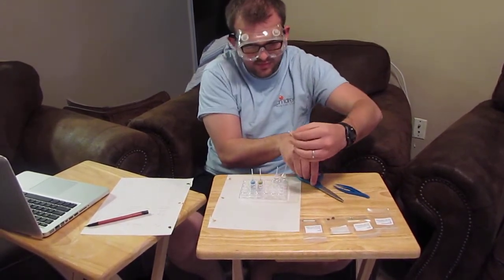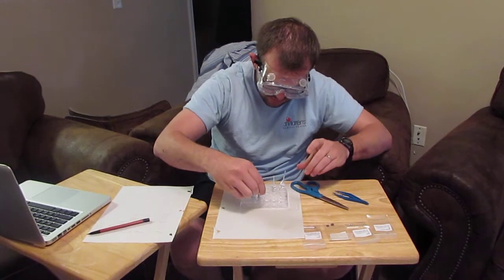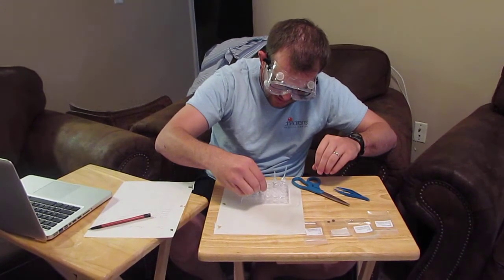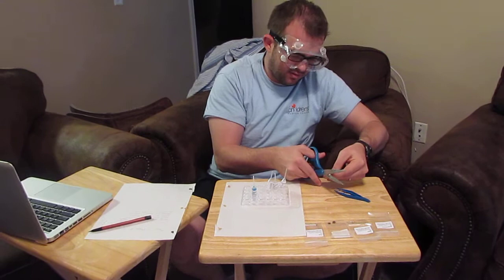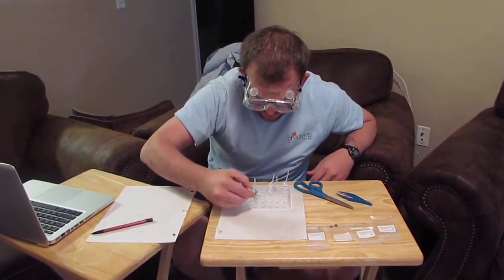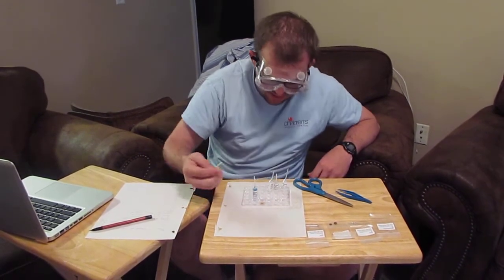I have zinc nitrate. In A3, 2, 3, 4, 5, 6, 7, 8, 9, and 10. Then we have iron chloride, iron 3 chloride, in A4. 1, 2, 3, 4, 5, 6, 7, 8, 9, 10.